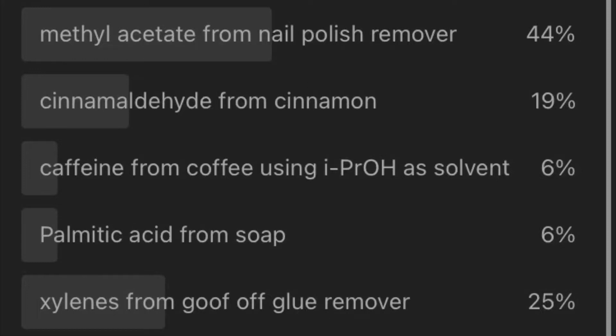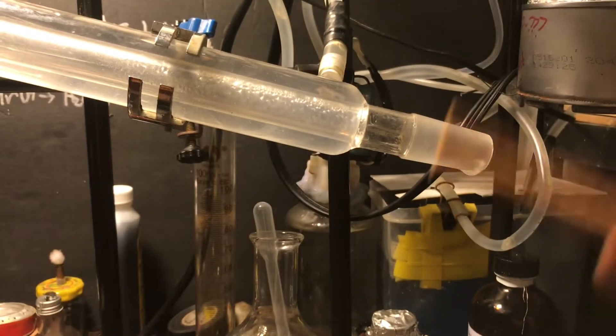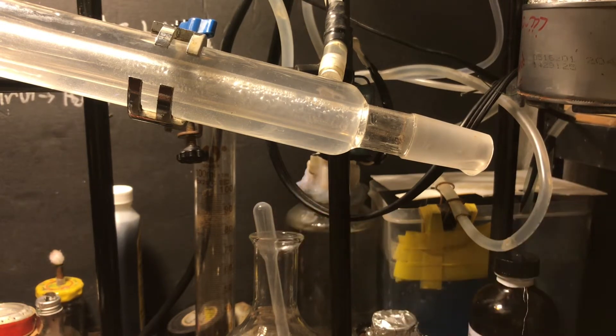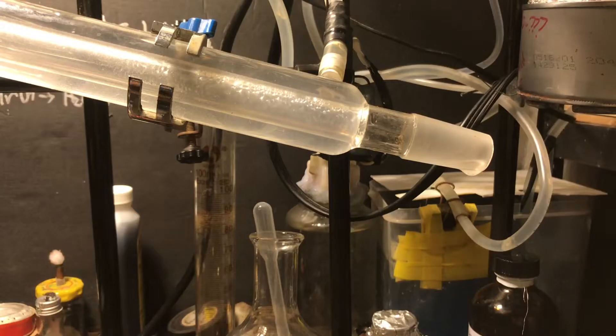Welcome back. Today we're extracting cinnamaldehyde from cinnamon using steam distillation. Cinnamon is my favorite spice — it smells and tastes great. I just had to try some, and yeah, it's really spicy. That's not pleasant. Don't chew on cinnamon, I guess. But at least I know that cinnamon has a lot of cinnamaldehyde in it, so let's get on with the actual extraction.